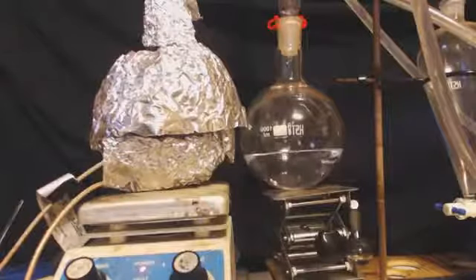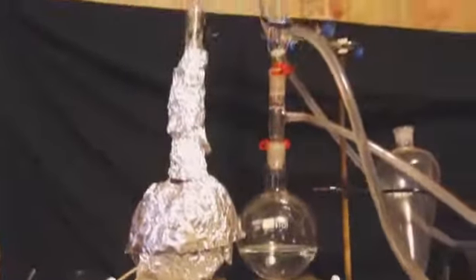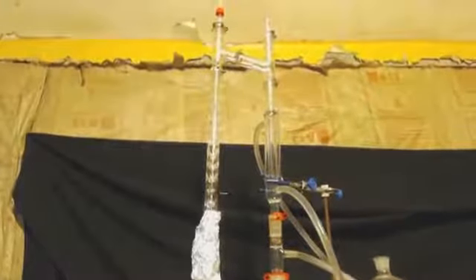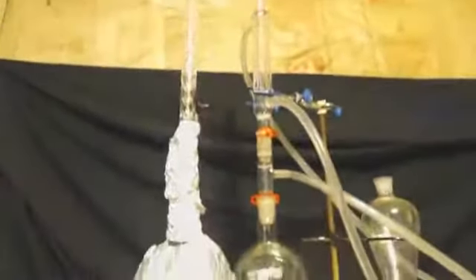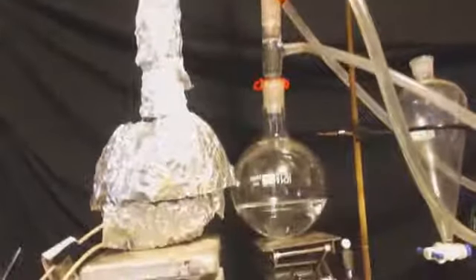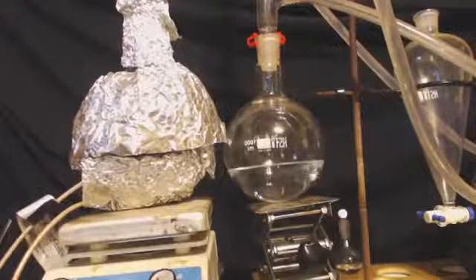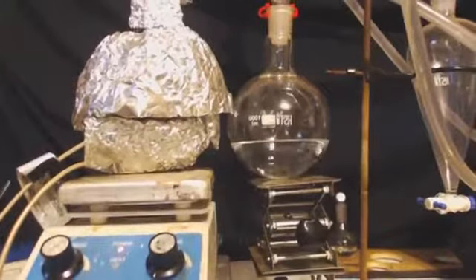And there to the right is my azeotrope. I have the second half. Remember, I couldn't fit everything into that round bottom flask because you got to put so much methanol in. The second half, though, I put the methanol and the azeotrope into the pot all by itself. I didn't need the equalizing funnel. And I'm going to fill it up. And you can see I'm almost done with this second part of it, getting all my azeotrope on the right-hand side there.